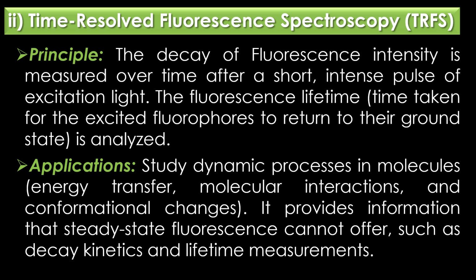Applications: this time-resolved fluorescence spectroscopy or TRFS is used to study dynamic processes in molecules such as energy transfer, molecular interactions, and conformational changes. It provides information that steady-state fluorescence cannot offer, such as decay kinetics and lifetime measurements.